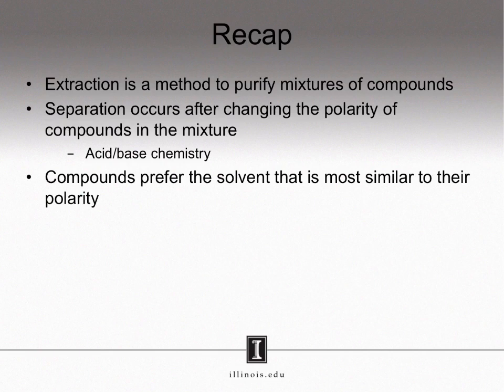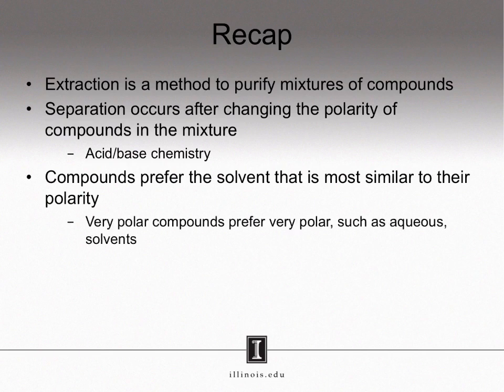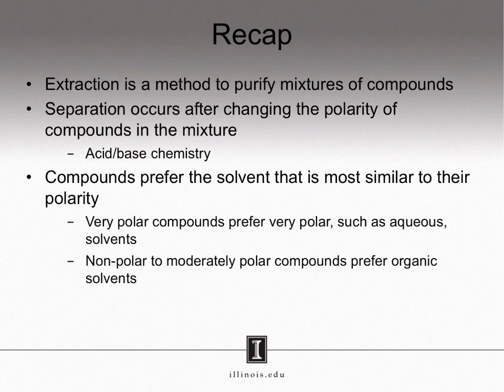Compounds prefer to dissolve in the solvent that is most similar to their polarity. Very polar compounds, such as the salts we just described, prefer very polar solvents such as aqueous solvents. Nonpolar to moderately polar compounds, most neutral organic compounds, prefer organic solvents. It is this difference in solvent preference that we exploit to separate compounds in a mixture in an acid-base extraction.